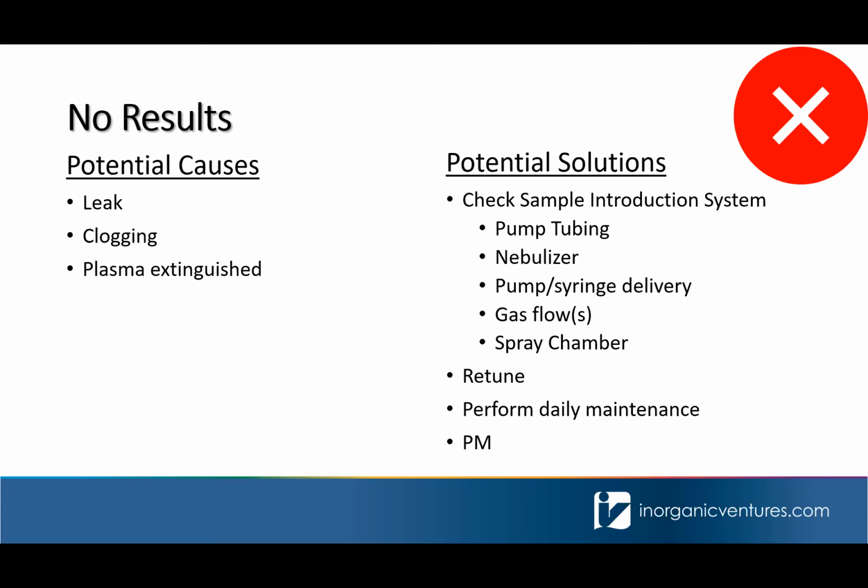Another issue that could result in no results is improper peak centering. What we recommend here is that you actually go into the spectral window. Don't rely on what's coming out of the instrument. Look at the actual peak and what's going on in that window. You want to confirm that your positioning is correct and that you fully understand any background corrections that your software is applying.